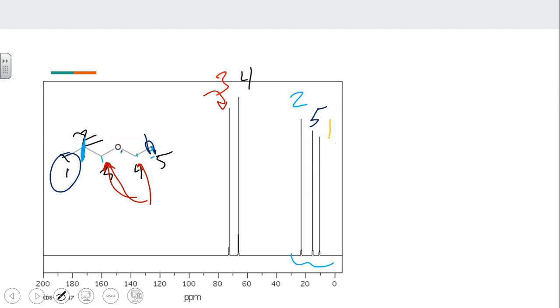Okay, so when I'm asking for full interpretation of an NMR, what I'm hoping is you can correlate all the carbons and all the protons with the structure that you're interested in to verify what the structure is in the lab. Okay. Again, I think it's a skill to be able to explain this in a way that makes sense so that you are conclusively indicating that the product was made, or maybe the product wasn't made. Okay, so this is what a complete interpretation would entail.